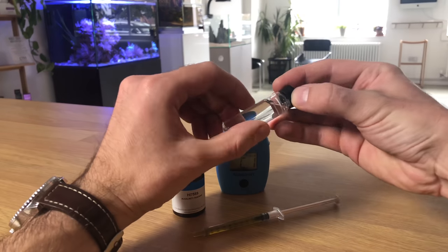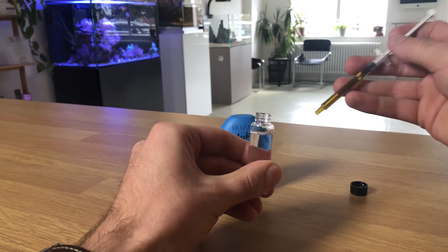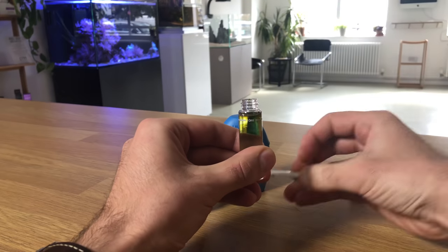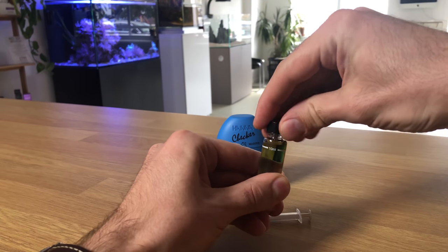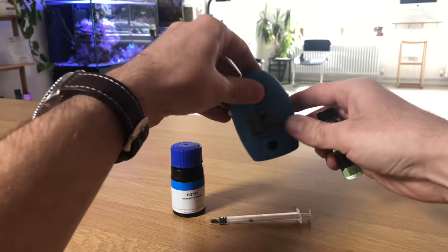The tests work in the same way a traditional test kit would work. Basically, you would fill the vial with sample water up to the line and then you would add a reagent. But instead of comparing that to a traditional colour card, you would put the vial into the checker and the onboard colour meter does the rest for you.